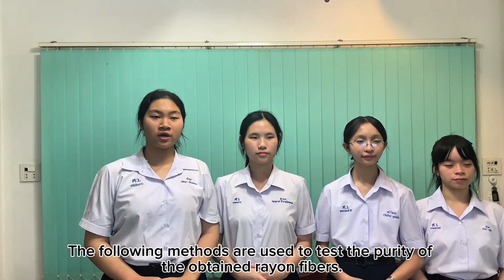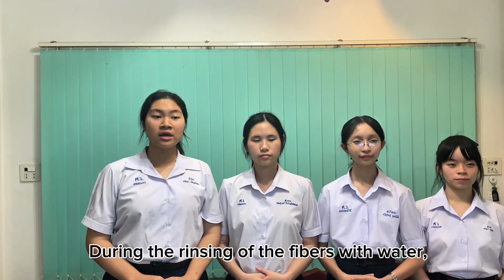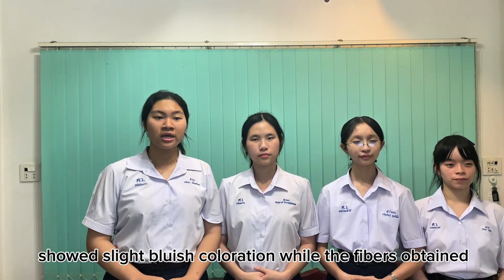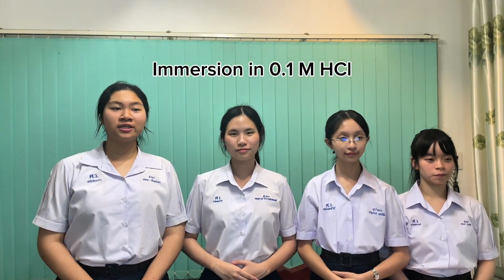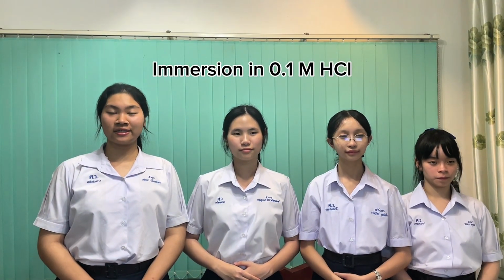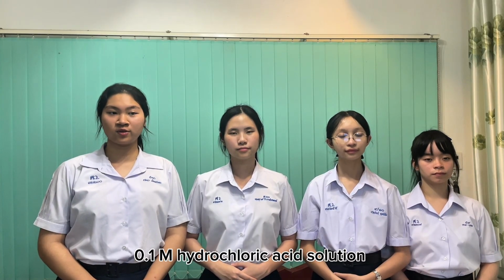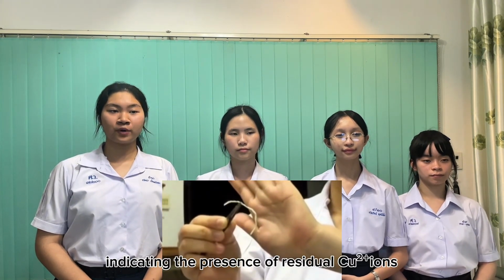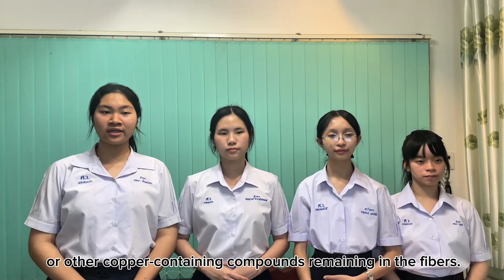The following methods are used to test the purity of the obtained rayon fibers. First, visual inspection. During the rinsing of the fibers with water, some of the rayon fibers prepared using the second method show slight bluish coloration, while the fibers obtained from the first method were completely white. Second, immersion in 0.1 molar hydrochloric acid solution. When the rayon fibers were immersed in 0.1 molar hydrochloric acid solution, the fibers prepared using the second method turned slightly bluish, indicating the presence of residual copper(II) ions or other copper-containing compounds remaining in the fibers.